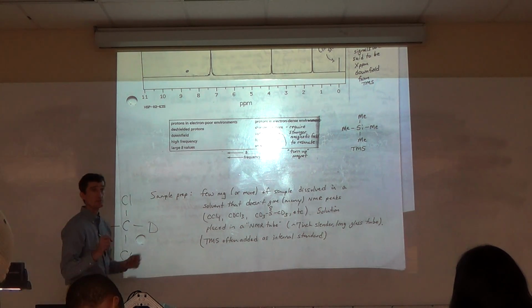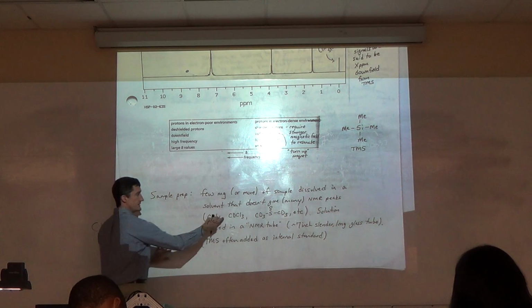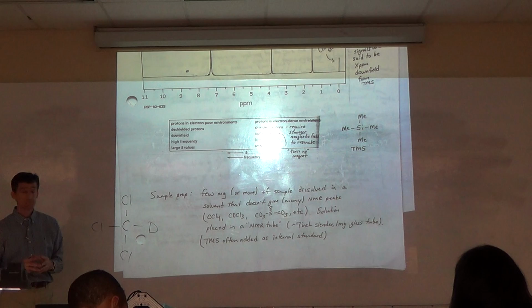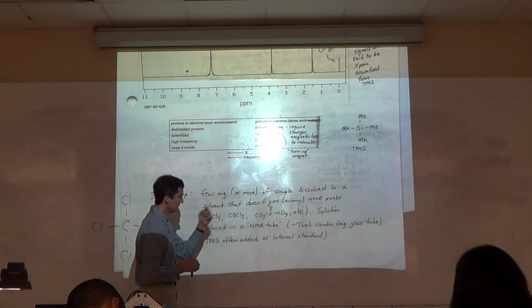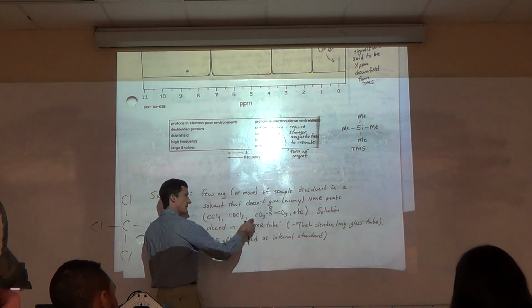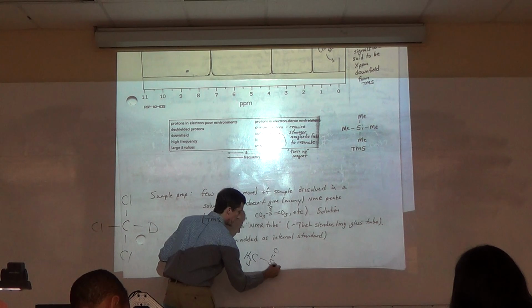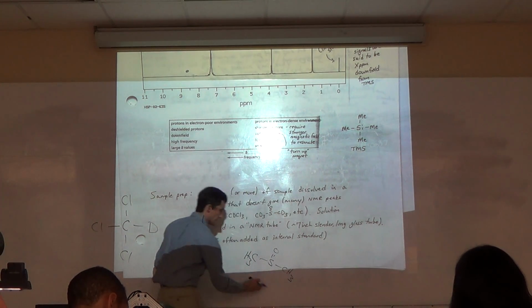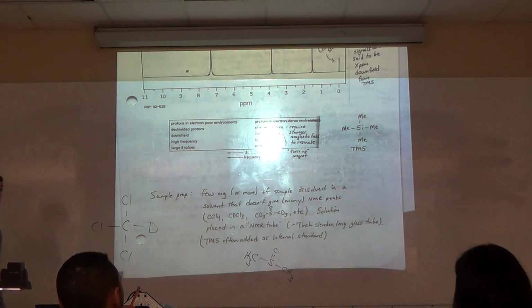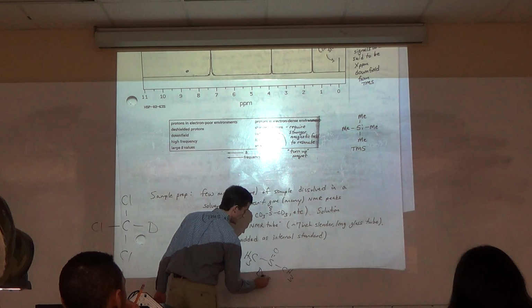So what you typically use is deuterated solvents. You can buy these. This is called CDCl3, or deuterochloroform. I don't like the solvent still. My favorite solvent is this one, which is, if these were methyls, anybody know this one? Dimethyl sulfoxide. Dimethyl sulfoxide, also known as DMSO.